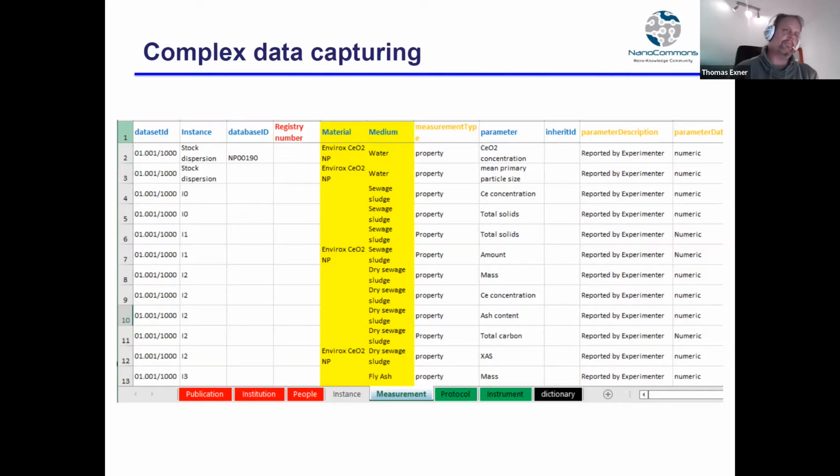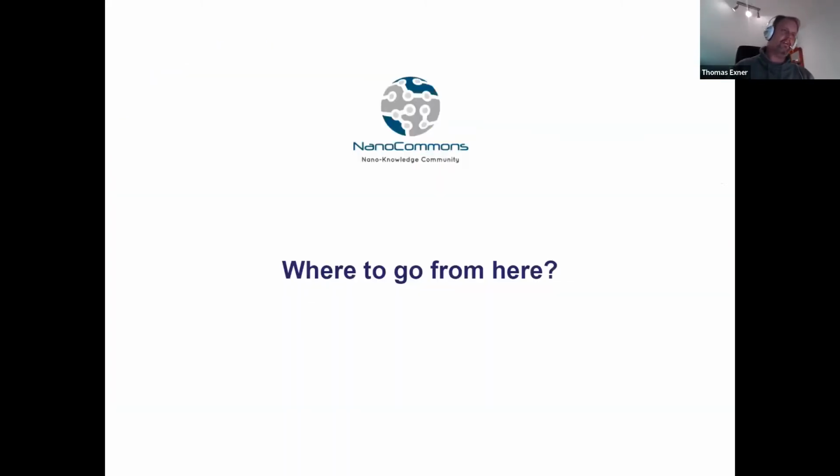It's a little bit complex, or not a little bit complex, but perhaps even a little bit messy when you have to do that. Therefore, we were thinking, can we go from there and improve on that a little bit?